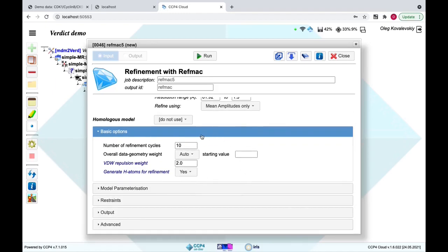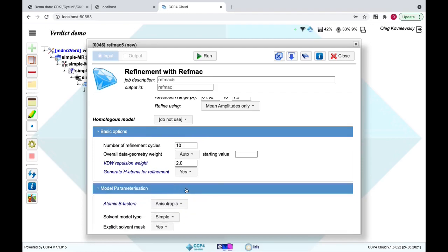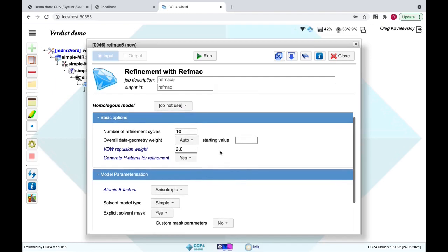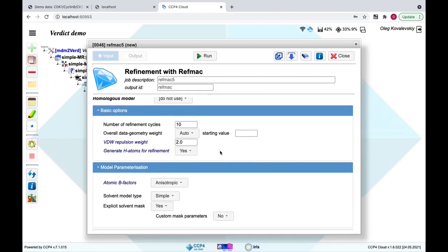And okay, here you see some parameters are highlighted by blue. Those are suggested values modified by the automated user advice system. Still, you're in full control. You can modify these values however you like, but let's get back to the defaults.